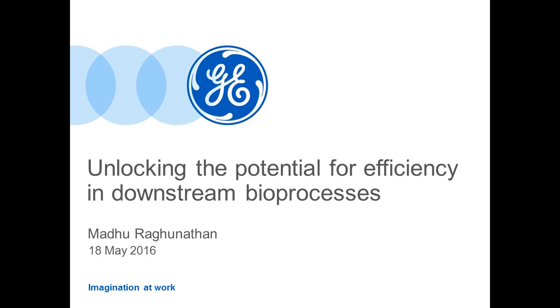And as you start to go up in scale, as you start to look at commercial manufacturing, where your process is already extremely optimized as a way of keeping your efficiency high and your costs down, continuous chromatography isn't nearly as beneficial, right? But then, it also depends on a lot of the other starting points in terms of what does your manufacturing frequency look like, scale, like we talked about, what are your flexibility requirements.